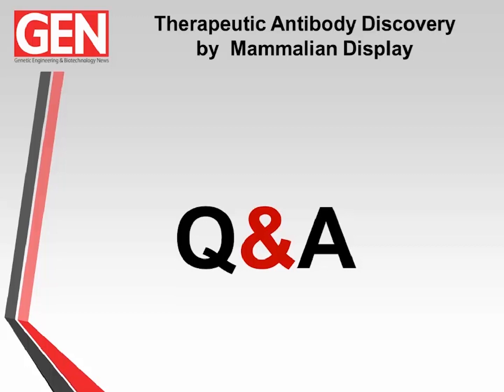Yeah, so here at IONTAS, and in the days before that, both at the Cambridge Antibody Technology and the Sanger Institute in Biochemistry, we've always used phage display, and we're great fans of the technique and technology. But of course, the input antibodies can come from any source, from any direction. And as I said earlier in the presentation, sometimes people go on about antibodies from phage display being difficult to work with, whereas in fact what phage display gives you is enormous power in terms of making large libraries and in terms of driving selection towards high affinity.